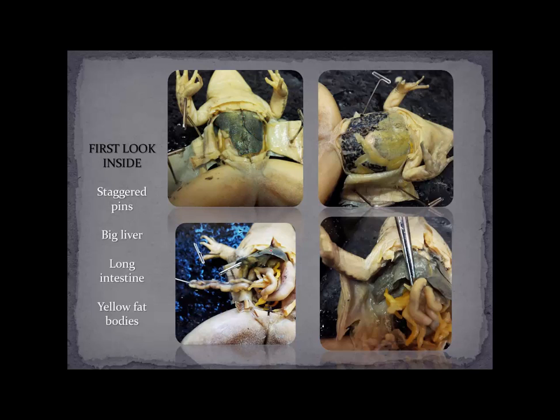We've lifted the liver up so you can see what's underneath it. We're going to have the stomach here and look at that later. The small intestine kind of starts around here, curving around. This student has removed the small intestine and pulled it off to the side, pinned it down, so you can get a sense of just how long that intestine is. There is a large intestine deeper down in there.